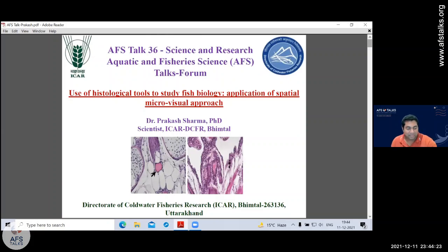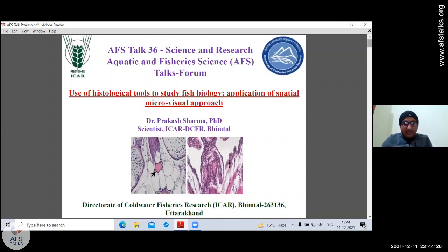One thing I'd like to tell here is why I was interested to give this talk. Histology or histopathology is a very conventional tool. People are not using it because nowadays people are more interested in molecular tools to study science, or some other advanced tools. But I find this tool and technique very interesting, because we can see what is happening inside the fish at the tissue level or the cellular level.